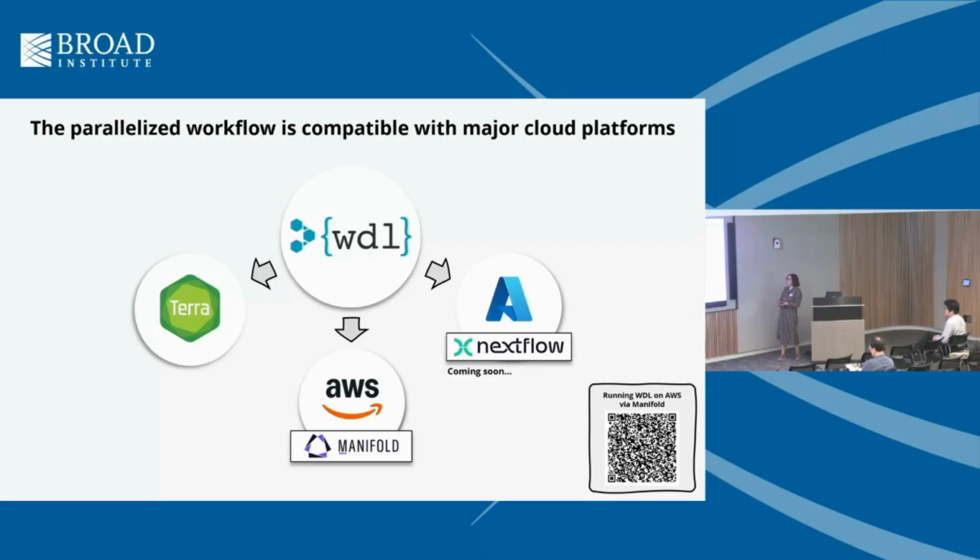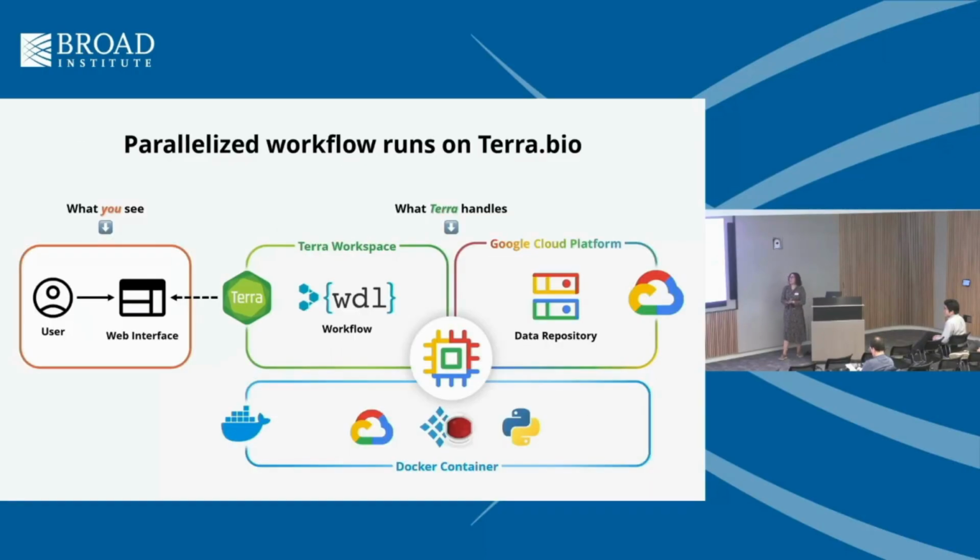But today I'm mostly going to talk about Terra, which is our on-site cloud-based platform that we use a lot at the Broad. The reason I want to highlight Terra is that it has a nice web interface that is really easy to hop into if you don't have a lot of cloud computing or computational experience. So as the user, you're going to see a graphical interface where you can point, click, upload files, and run workflows without having to get into all the muck of looking at a workflow, looking at a Docker, things like that. So that's why I think the Terra platform is a nice way to get started with Spectronaut parallelization on your own.